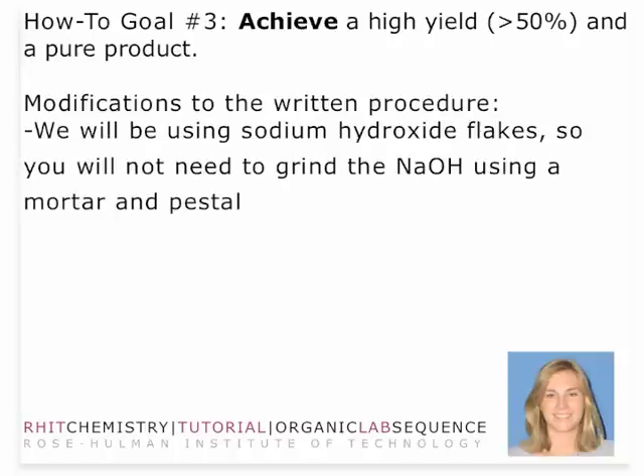We will modify one place in the procedure for this week's reaction, and that is the grinding of sodium hydroxide. We actually will not use a mortar and pestle — we'll be using sodium hydroxide flakes. So we will not need to grind the sodium hydroxide. You might need to break it up a little bit, but don't grind it. We found that grinding was prohibitive to a good yield because sodium hydroxide is so hygroscopic — it was absorbing water, and as you grind it into the mortar and pestle, we were unable to get accurate measurements and weren't getting a good yield. So don't grind the sodium hydroxide. Just use the flakes.